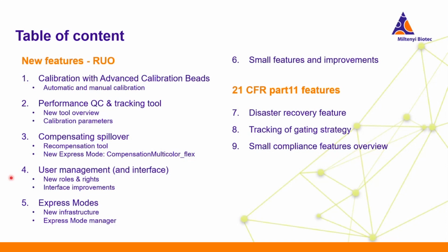Then we come a bit more into administrator regions. We will talk a little bit about the user management. There are some new roles and rights and also some different improvements here. We'll talk about the new express mode infrastructure and about the express mode manager that can be used to install, deinstall, deactivate, activate express modes on the device and also in the software version. And the last section is just additional small features and improvements.